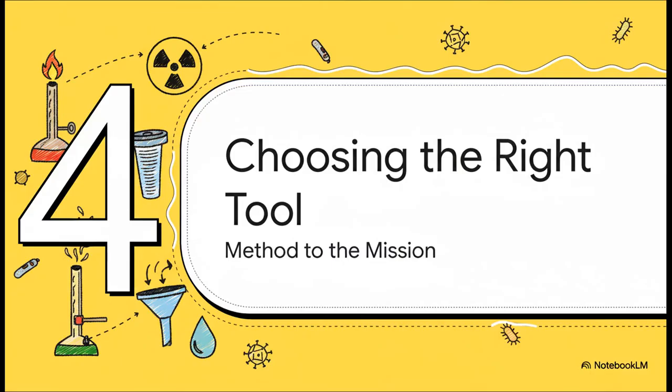And that right there brings us to the most important lesson of this entire explainer. Sterilization isn't about having one perfect tool. It's about having a whole toolkit and knowing exactly which one to pull out for the job at hand.